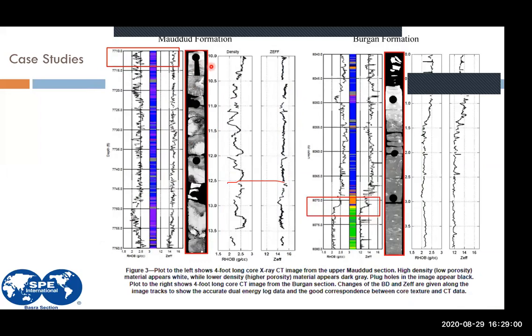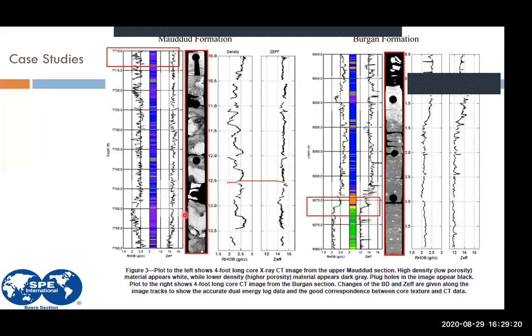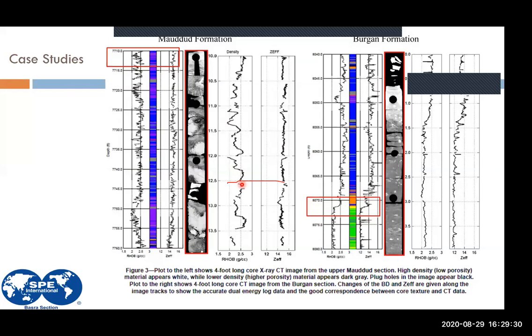As I mentioned before, we can work even if this kind of core is already plugged, if you have this kind of fractures, if you're losing some material, you can consider this, of course. Some of these regions here, you don't have complete information, but it can help you a lot to identify at least some regions here that are interesting.